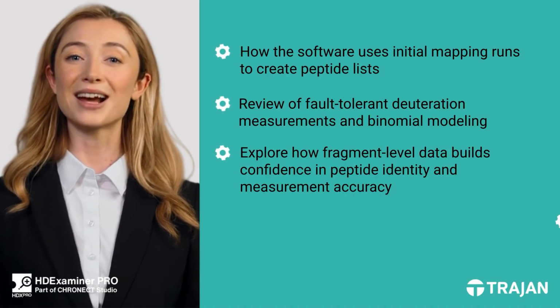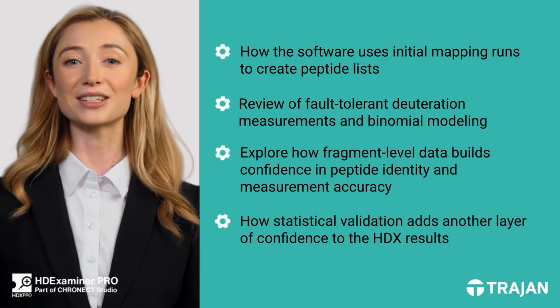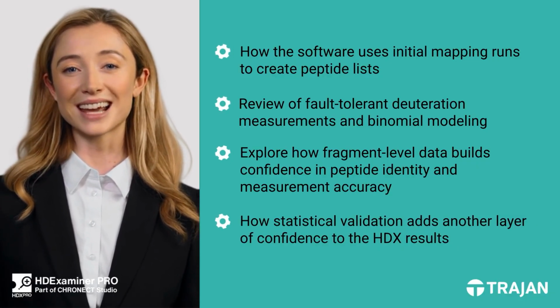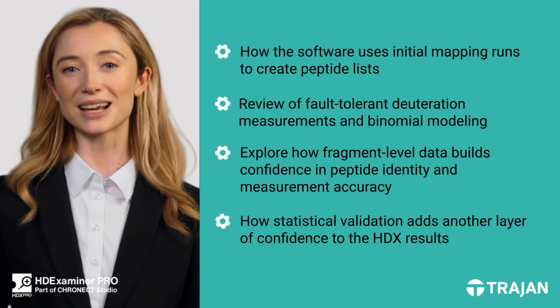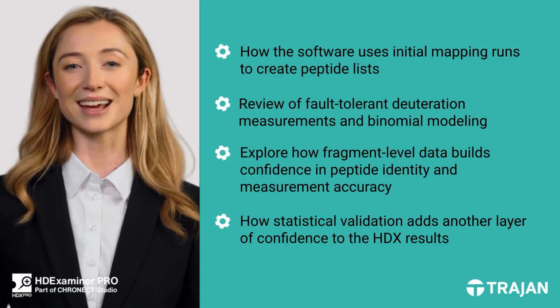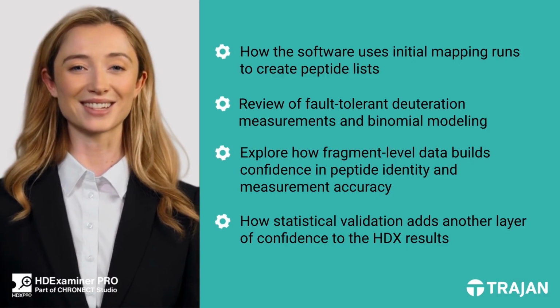Finally, we'll look at how statistical validation adds another layer of confidence to the HDX results. By the end of this session, you'll understand how DIA not only confirms peptide identity, but also enhances data reliability and reproducibility. Let's get started.